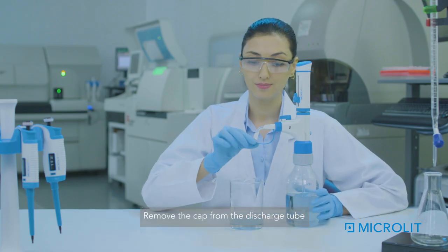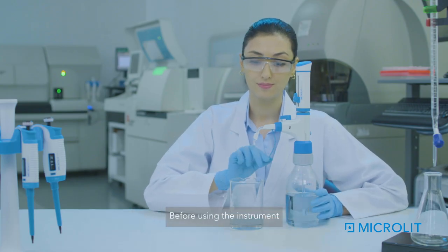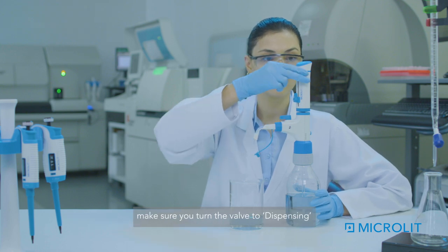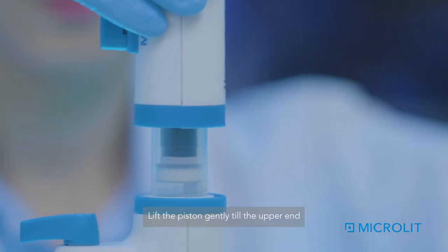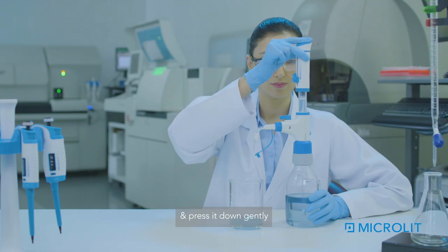Remove the cap from the discharge tube. Before using the instrument, make sure you turn the valve to dispensing. Lift the piston gently till the upper end and press it down gently.